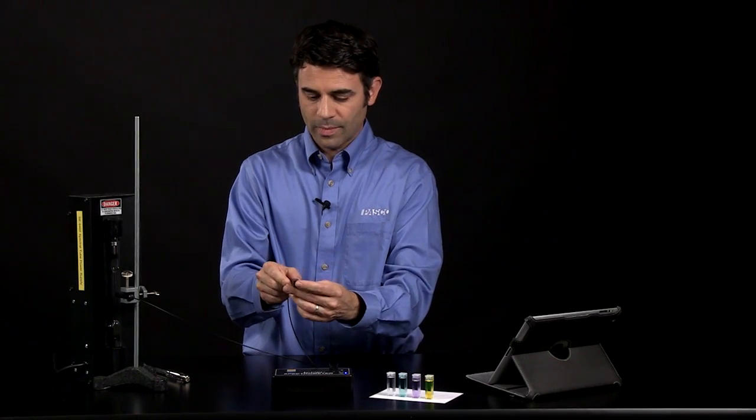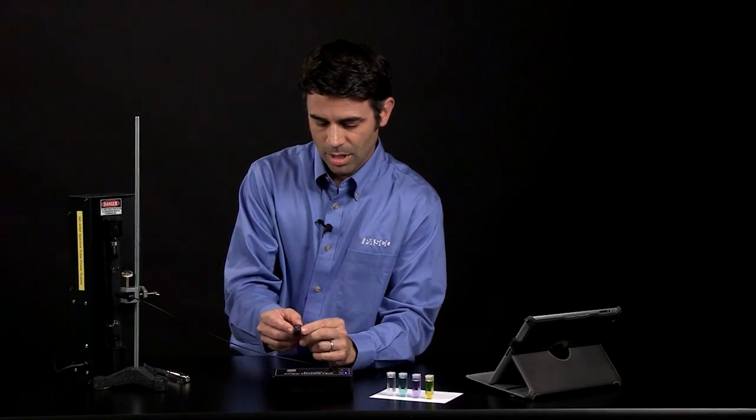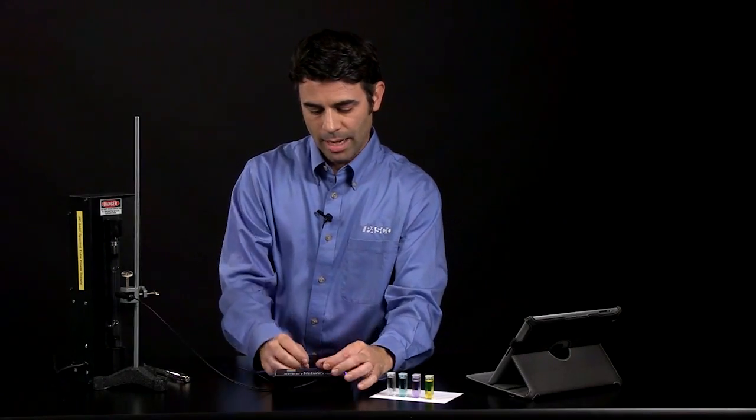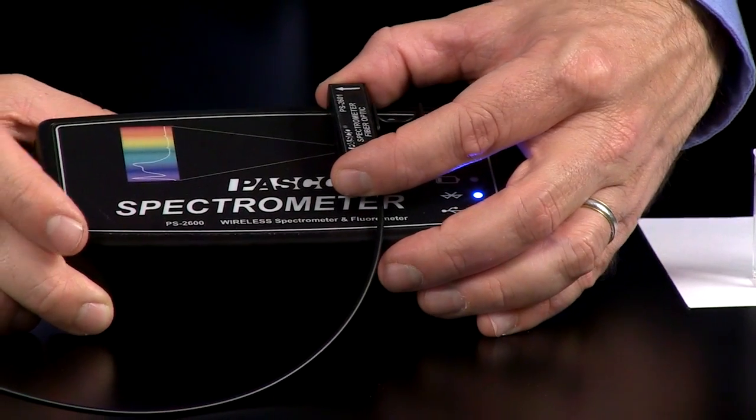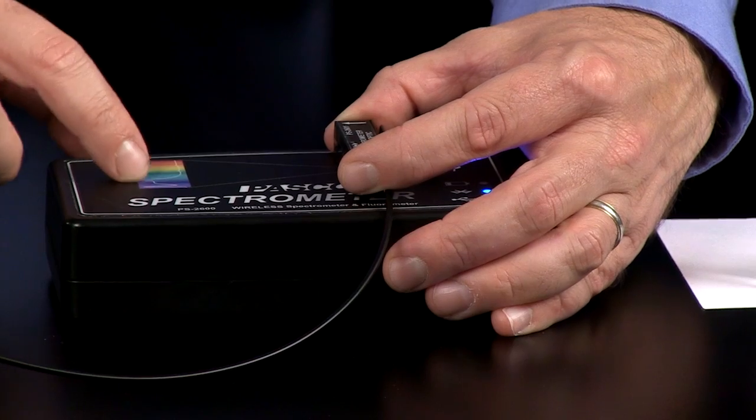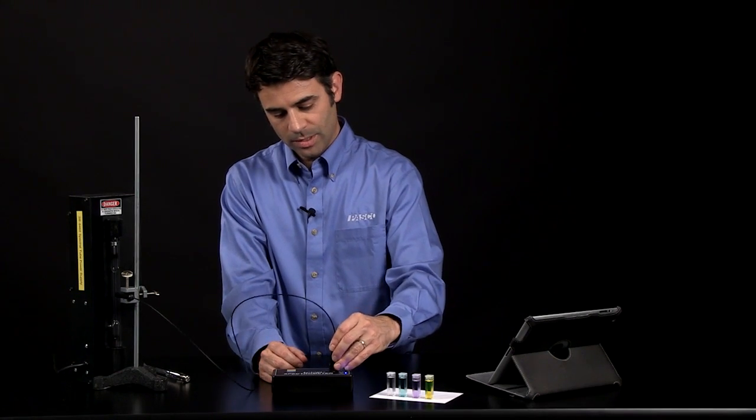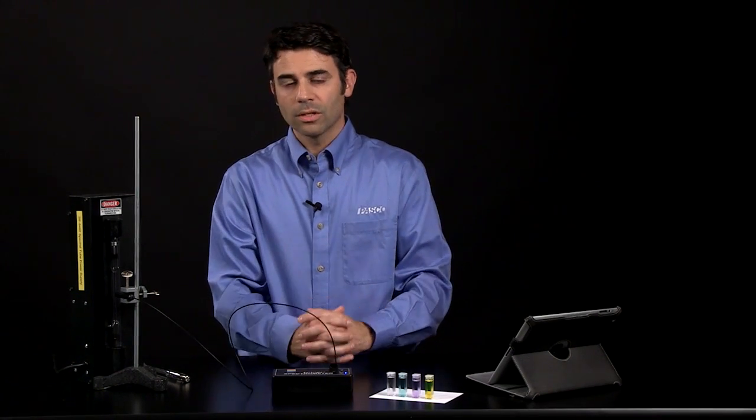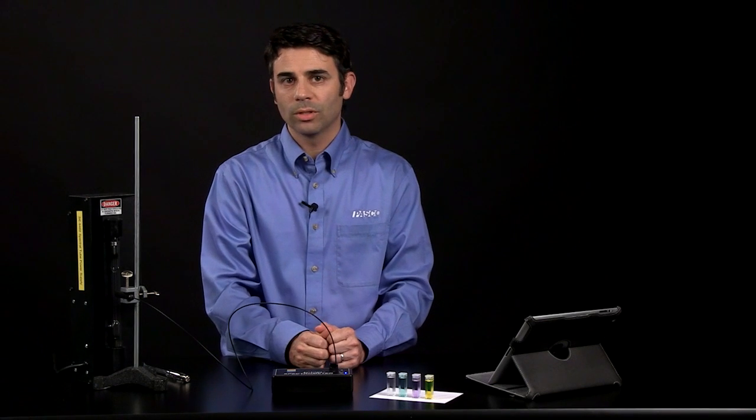The other end of the fiber optic accessory goes into the spectrometer. The arrows are going to be pointing towards the detector. That tells you how to line up the cuvette. I'll put this in. It's a very snug fit, so that it doesn't wobble around when you're doing your analysis.